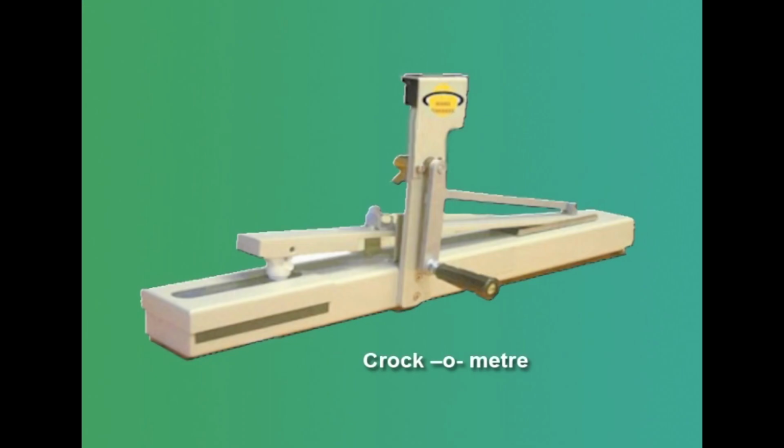Color fastness to crocking is especially important for apparel and upholstery. The device used for this test is called a crockmeter. This is a simple test procedure that can even be done at home.